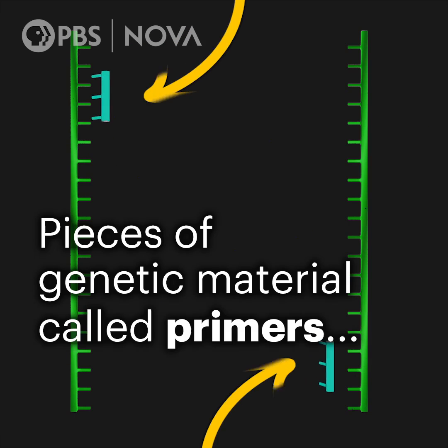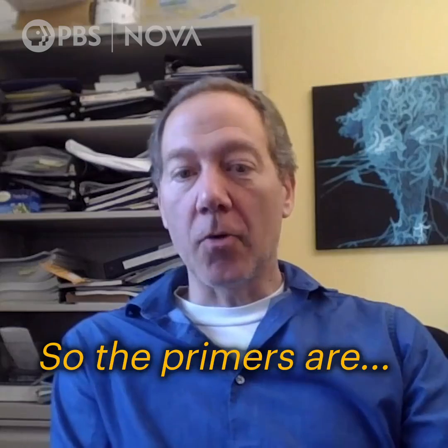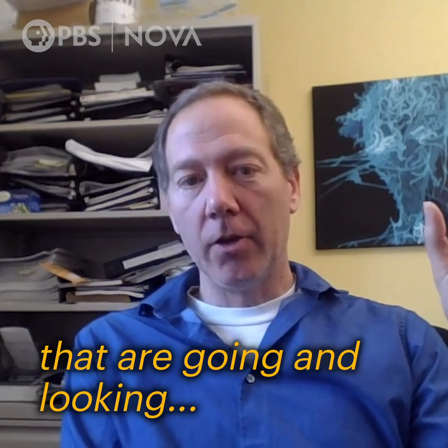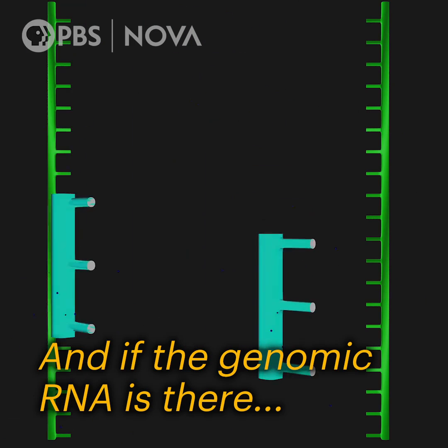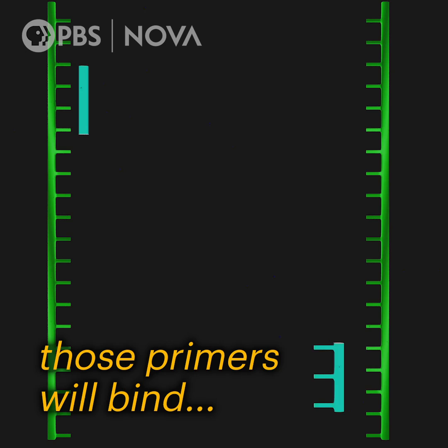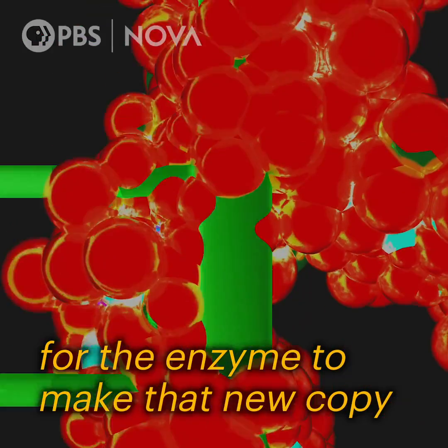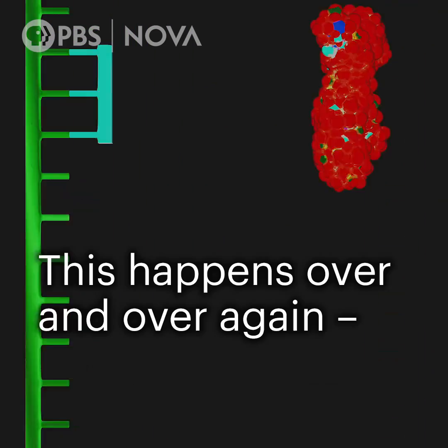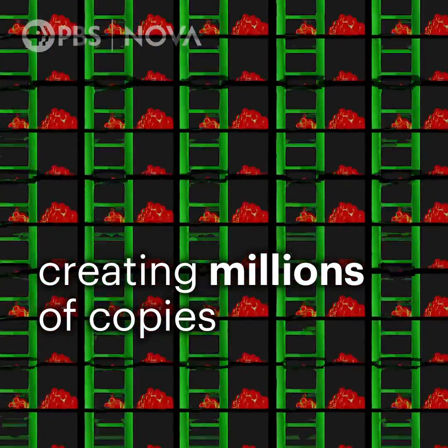Pieces of genetic material, called primers, are added to the tube. Right, so the primers are those small pieces of DNA that are going and looking for the genomic RNA. And if the genomic RNA is there, those primers will bind. And that binding makes a landing site for the enzyme to make that new copy. This happens over and over again, creating millions of copies.